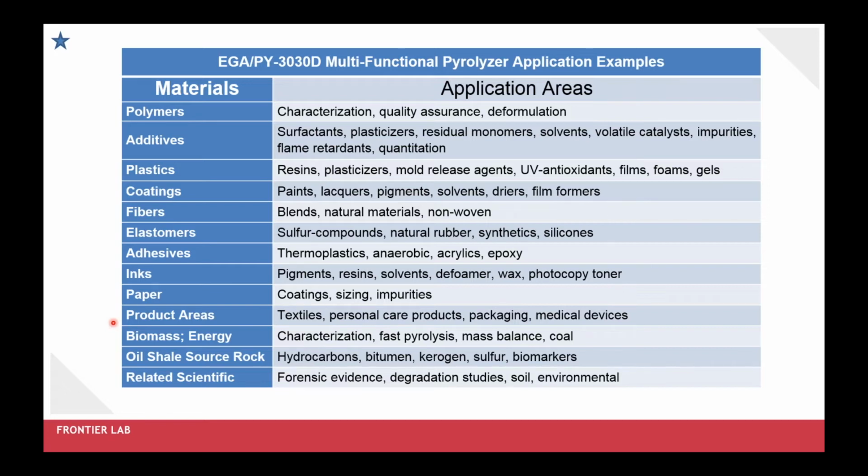I already mentioned shale oil above, along with the energy. And then forensic work that can often be involved with fibers or coatings and other kinds of environmental samples. So that gives us a range of applications.